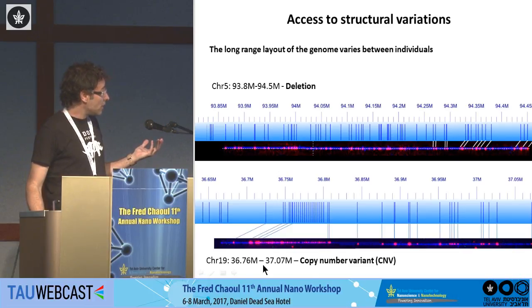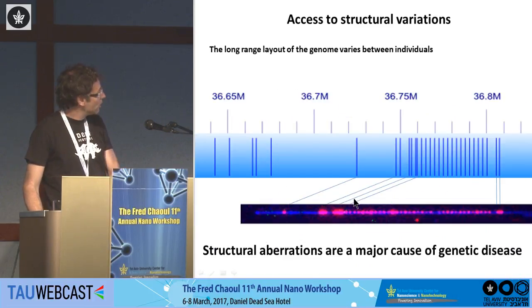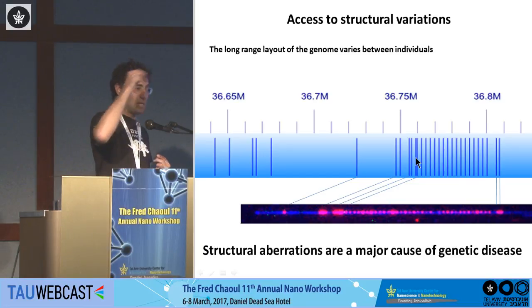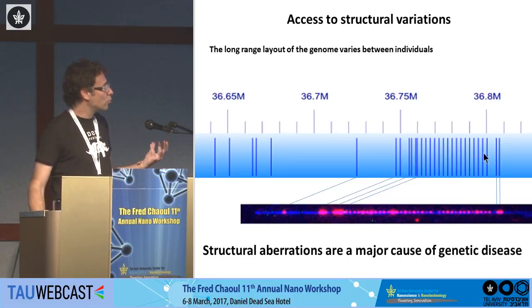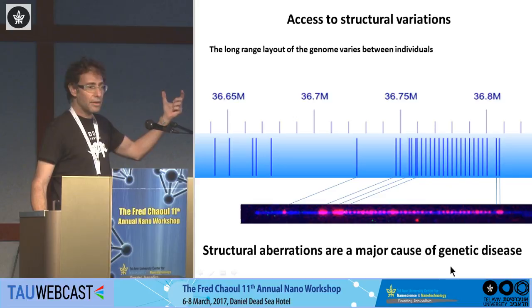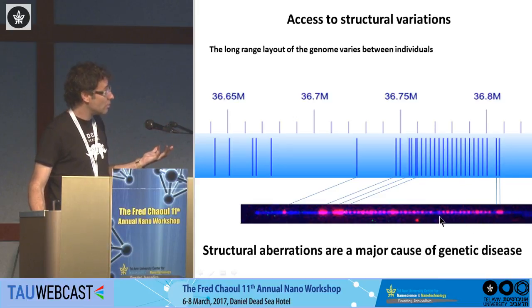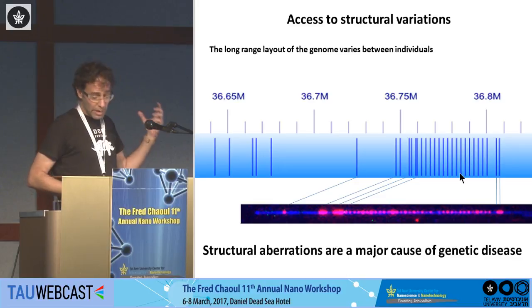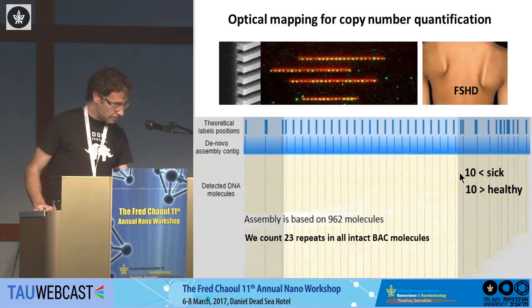And another thing are these copy number variations. Let's zoom in on this. About 40% of the human genome is composed of these repetitive elements, sequences that repeat themselves many, many times. When you do sequencing, you never know how many times they repeat, because this is much, much longer than a read length, but on the microscope we can physically see them as equally spaced dots of fluorescence, and you can see in this example that there are double the repeats than what is in the human genome reference. And again, this is a major point of variation between people, and also a major source of disease.